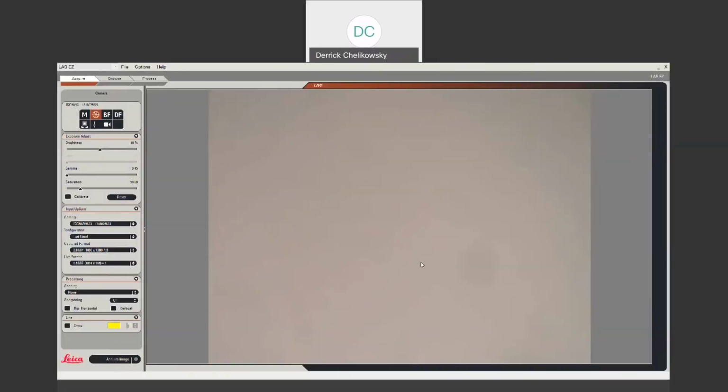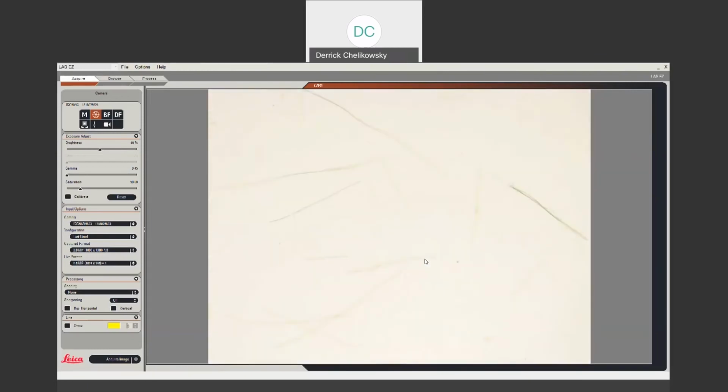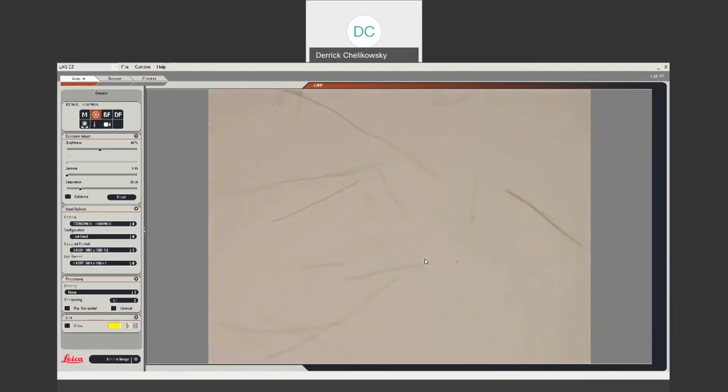And we are back. This time we are going to take a look at some Oscillatoria. Again, a little filamentous alga. Let's zoom in a bit here. See what we have. You see there are some moving cells, which is nice to see. And there we go. This really is what we're looking for right there. Beautiful. And this is on 40 times.